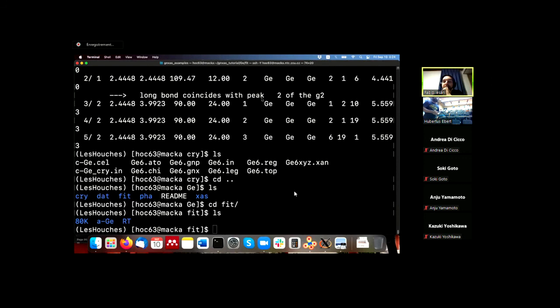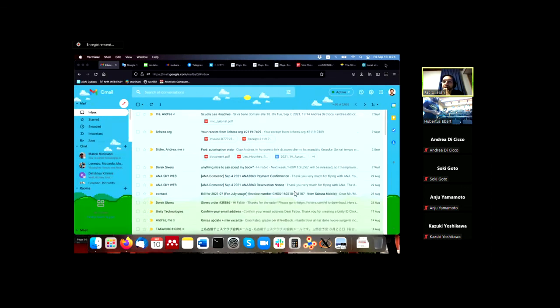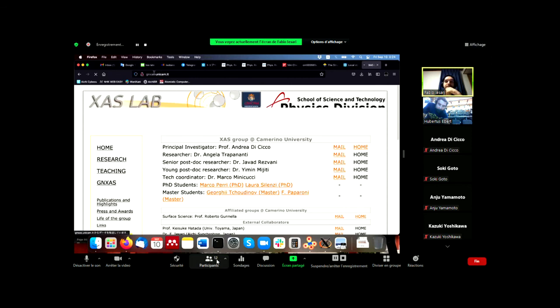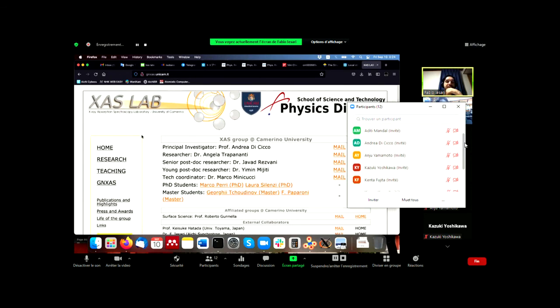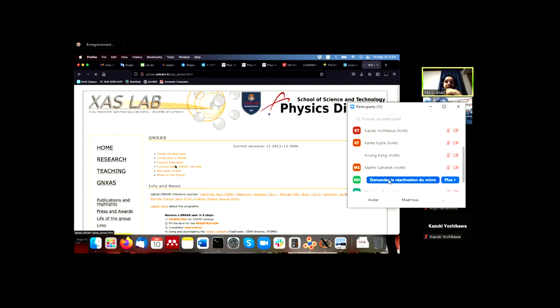Yeah, and I remember the GNXAS website. Actually, maybe I can show you. It is gnxas.unicam.it. So this is the website, and if you click here on GNXAS, you can find the information.